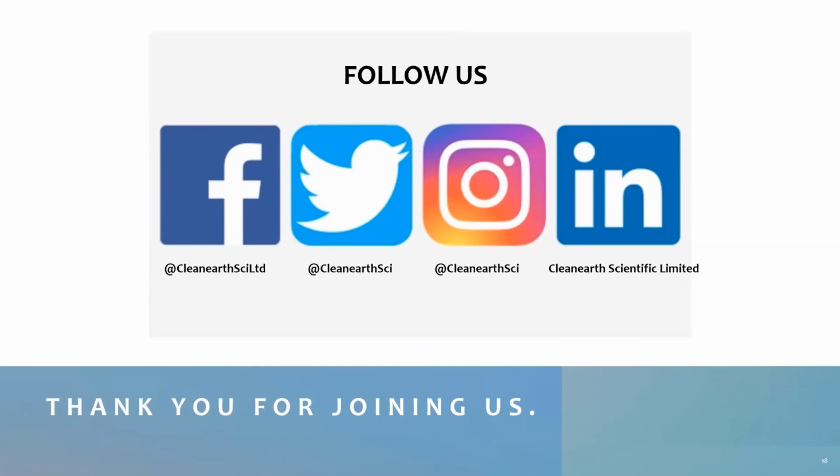Okay, thank you. Samuel, I believe you have your answer now. Let me reiterate that. Heating or sonication will not affect or maintain the integrity of water. It has to do with the container being used, preferably glass, and then the exposure. Once it is exposed, it will have the chance to dissolve other things which may affect the integrity. So heating or sonication cannot maintain the integrity.